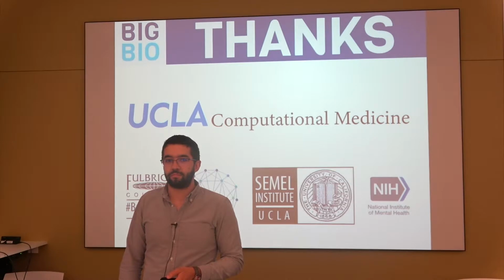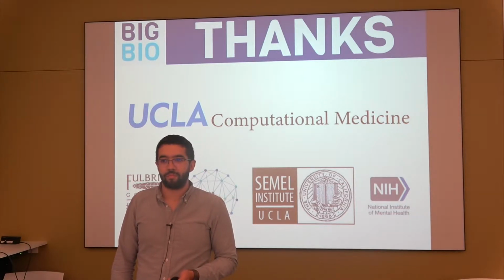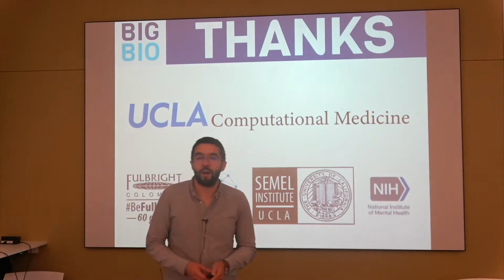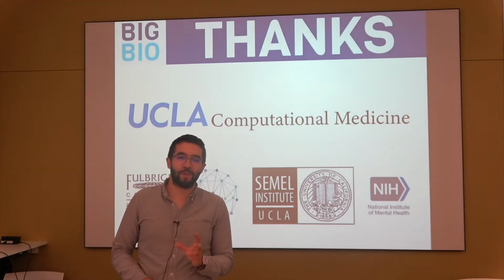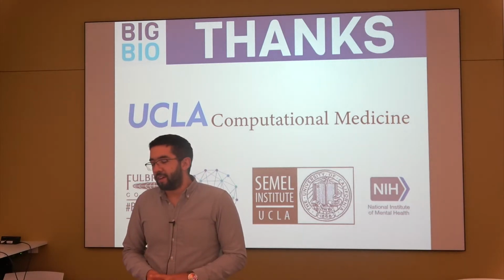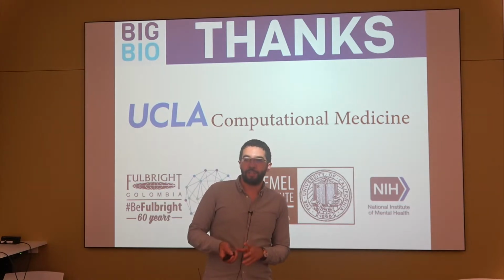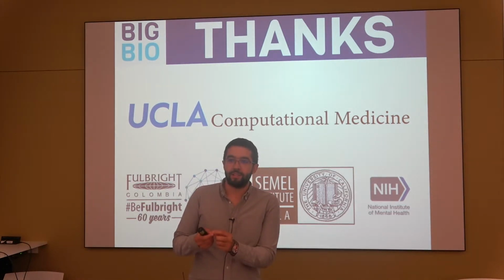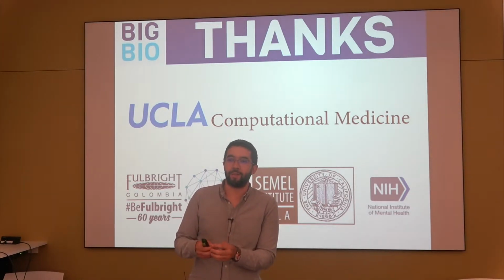How are they actually calculated, though? Do you know? No, it's a mystery. How do they know that the read was bad? The Phred score is assigned according to how confident the machine is that the base it is reporting is actually the base that is present in the DNA.